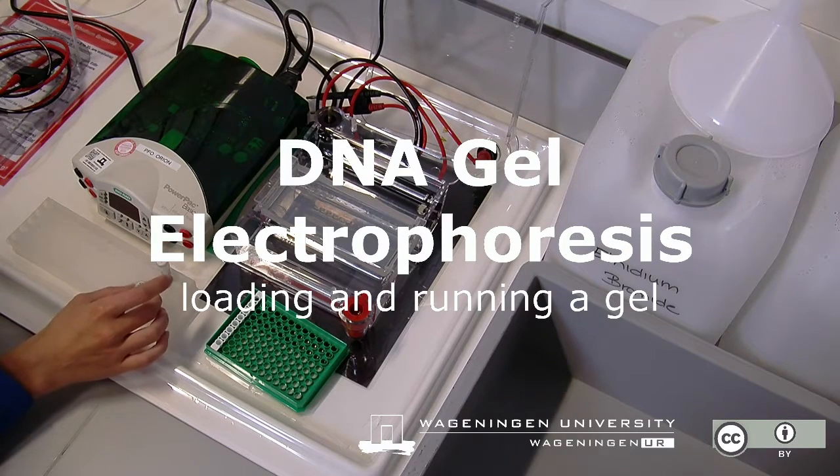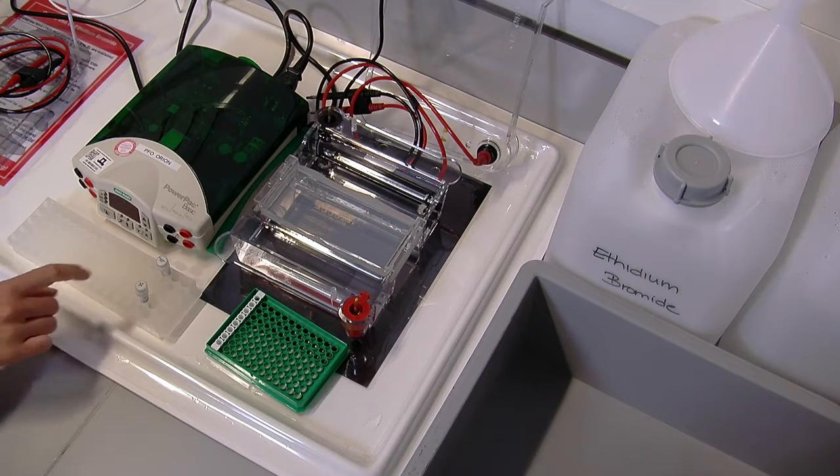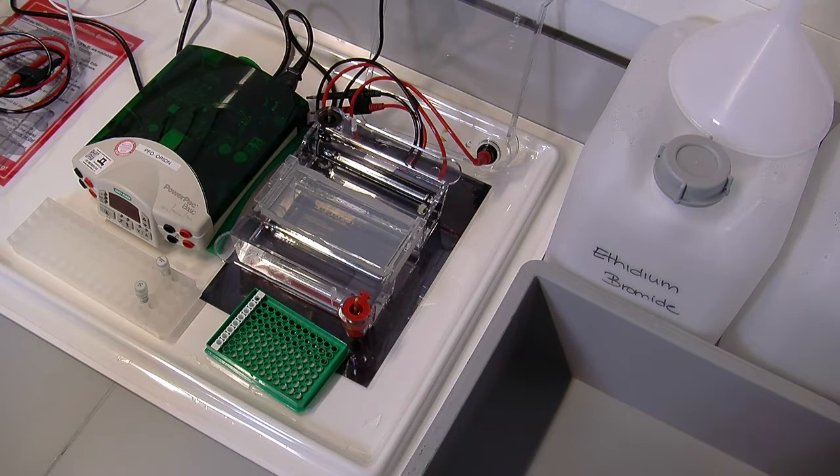Running a gel. We prepared a gel which is now submerged with TAE buffer in the tank. To load the samples and run the gel, you need your sample, DNA loading buffer, and a marker.